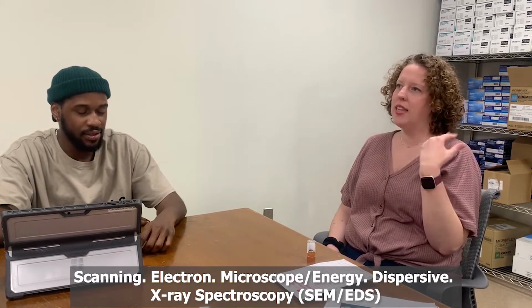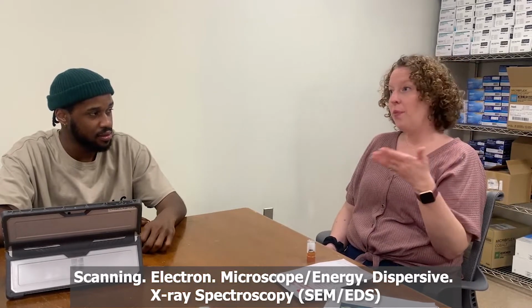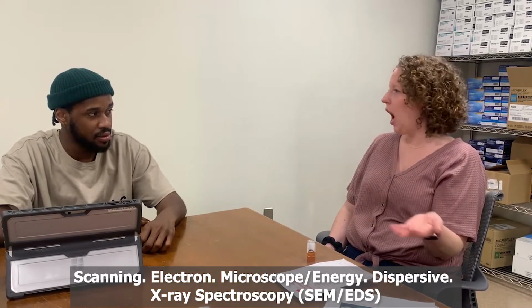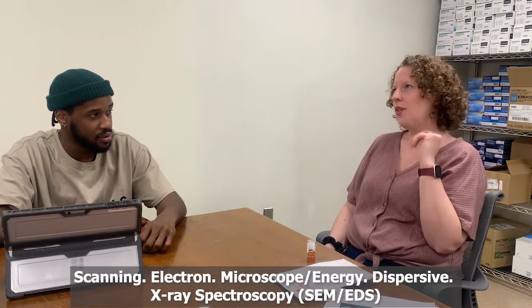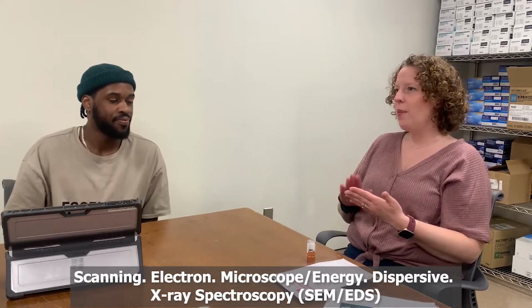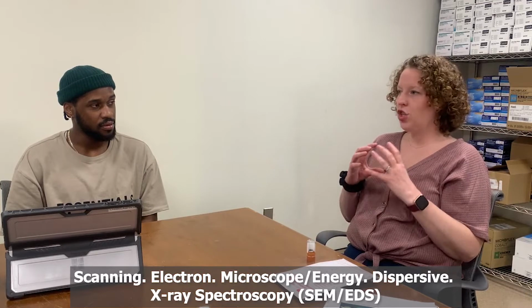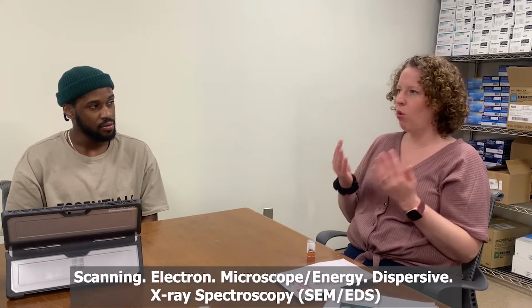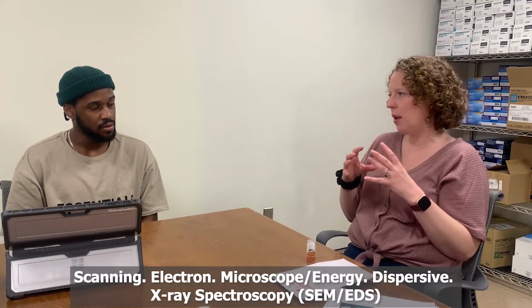Those X-rays are unique to the elements in the particle, like the periodic table of elements. So if there's lead, barium, and antimony, aluminum, copper, iron, all different types of elements that you may find in a particle. But again, that lead, barium, and antimony is what we require, as well as the shape. It needs to have kind of a molten spherical shape. It's not a jagged or cubic shape.